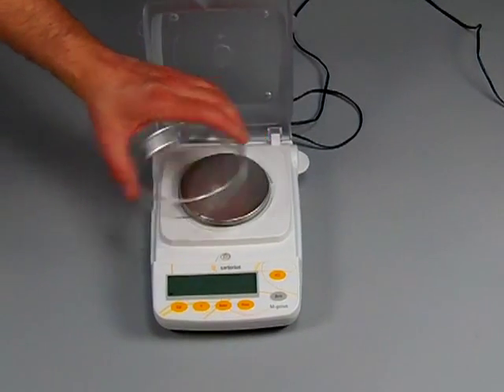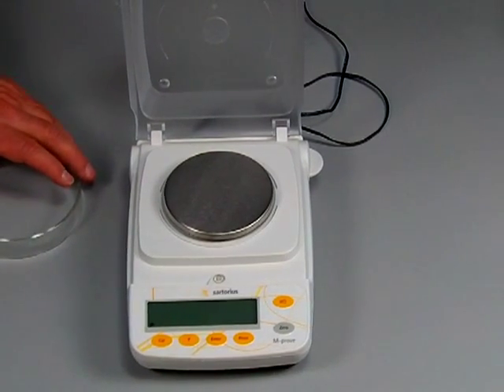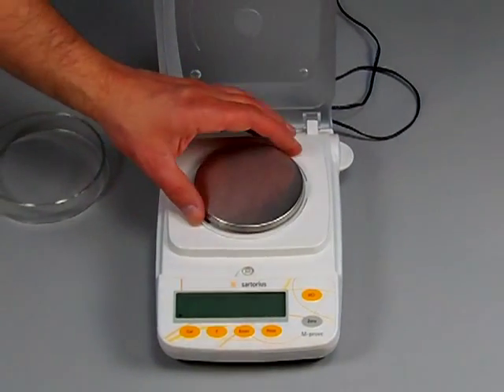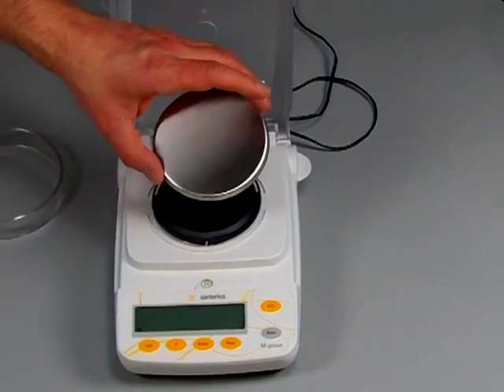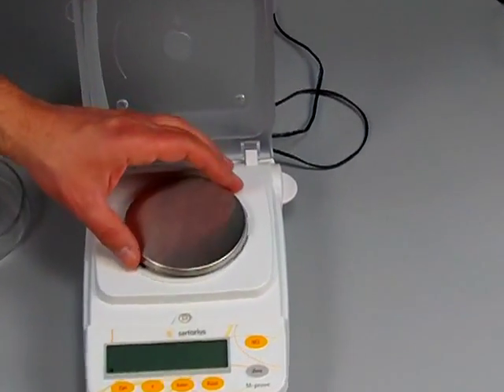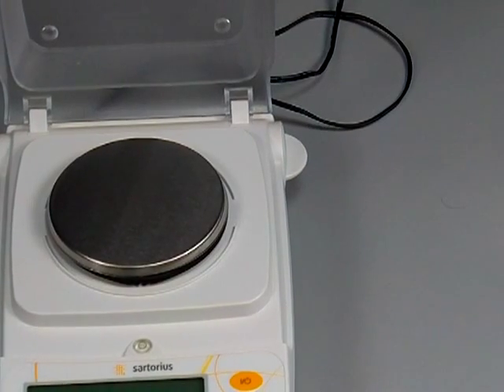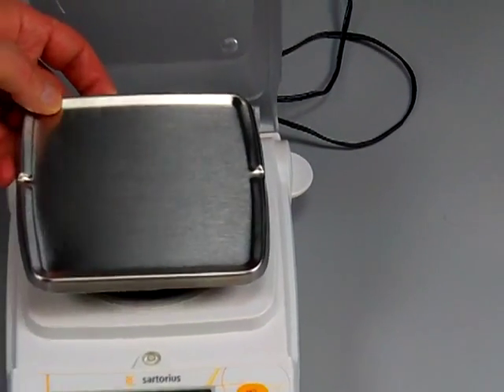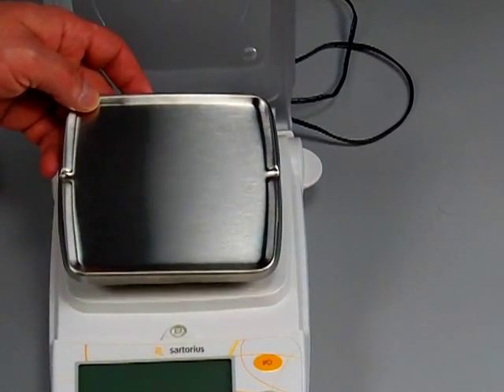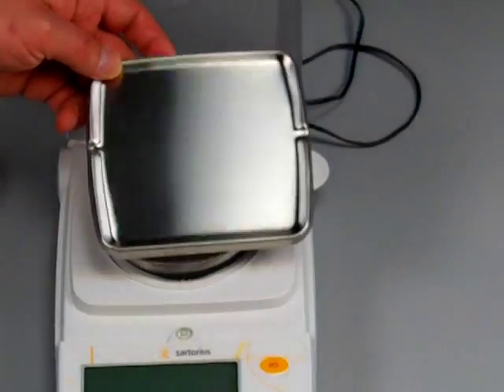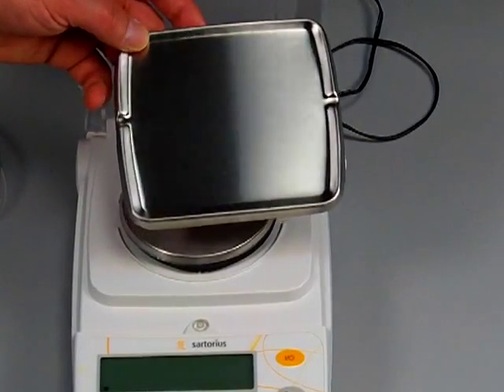Now these models have a round stainless steel platform. The diameter is 3.1 inches. The other models will have a rectangular platform, and that rectangular platform is going to measure 5.7 inches by 5.1 inches. So depending upon which model in the AY series you purchase, you will have to consider the weighing pan.